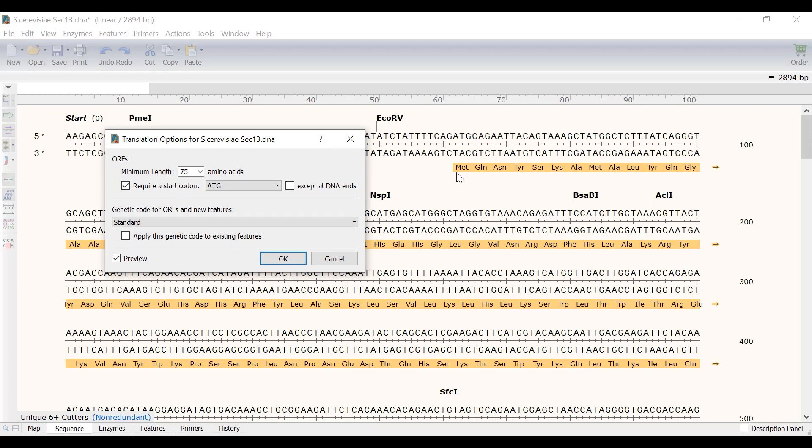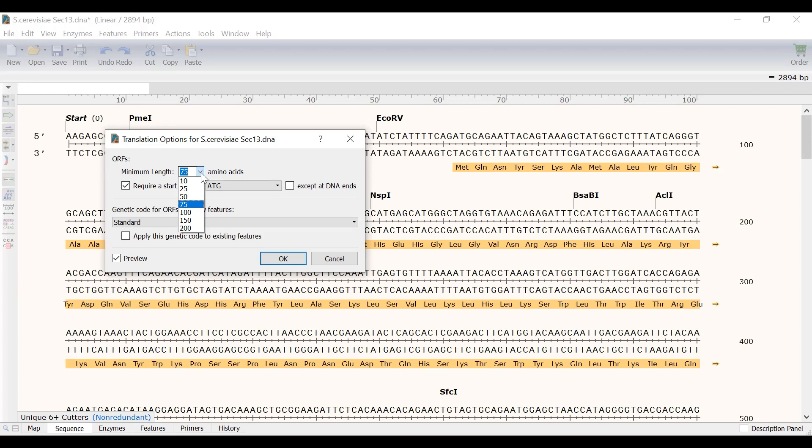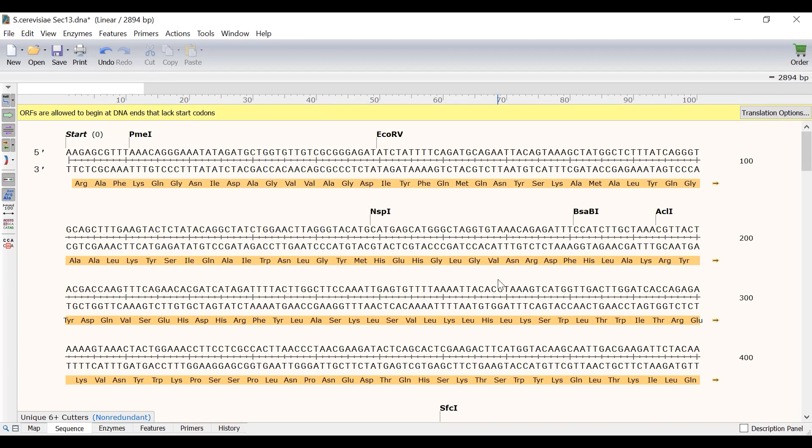Alternatively you can use the drop down menu and specify other start codon options. Note there are other translation settings that you can change in this window, such as the minimum length of the open reading frame. The default is 75 amino acids. I will click the cancel button to stick with the default translation settings for this example.